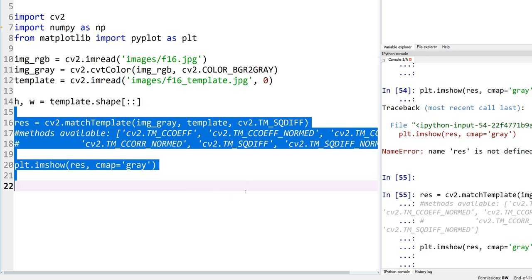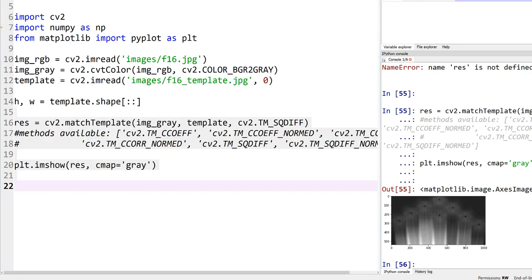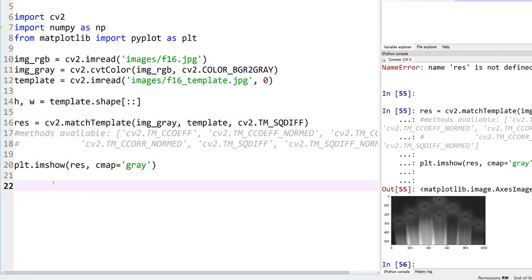So let's run these lines together. So we should actually see an image on the bottom right where at every pixel, it shows a probability of the template matching that specific box right around there. So as you can see, wherever you see these tiny dots like these pixels, that's where the template actually matched perfectly. Well, not perfectly, but very well.